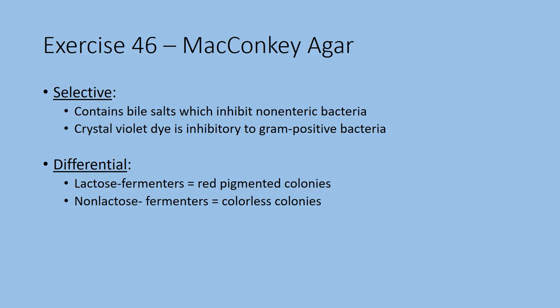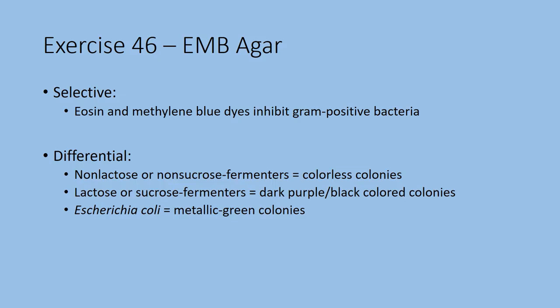Well, you can distinguish between the lactose fermenters and the non-lactose fermenters. They will both grow, but if it is a lactose fermenter, the colonies will be red pigmented. If it is a non-lactose fermenter, the colonies will be colorless. To see, you can look at the video links where the results are shown.